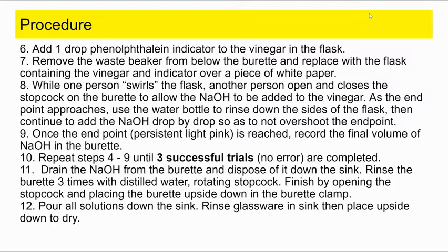And then finally, we'll drain the sodium hydroxide from our burette and dispose of it down the sink. Rinse the burette with distilled water 3 times, rotating the stopcock. And then we'll place it upside down in the burette clamp to let the next class know that it is ready to be used again. Finally, we'll rinse all of our glassware so that we can clean up the lab.